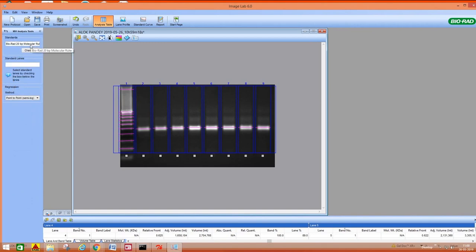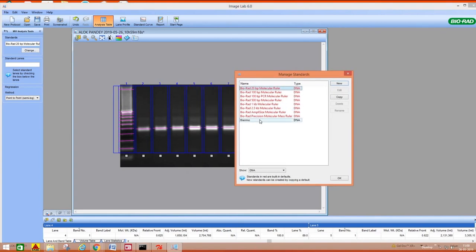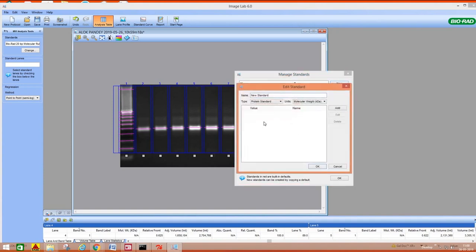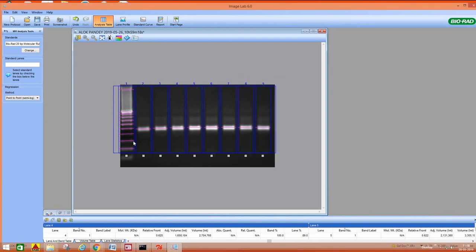Now you can go to molecular weight analysis. So here also, either you can give your choice of interest molecular weights, you can create new and add the values. This is here nucleic acids, molecular weight, base pairs. So in this way you can give, or you can use one that is already given in the software. As you can see, this is depicting here what is the base pairs amount of each lane. So here also this is same.